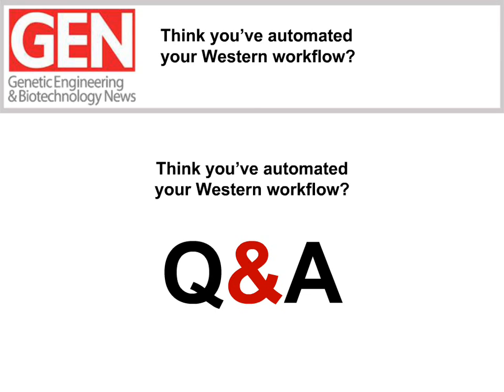It depends on the customer. Customers who are doing a lot of pathway work will look at more targets than someone who's interested in a specific target. We did show the Simple Western family. We've specifically talked about West, where you can do 25 targets per run.